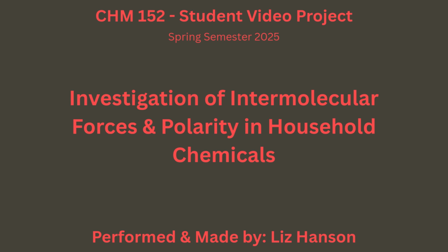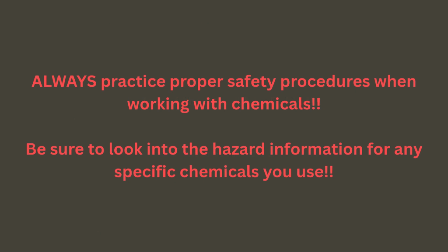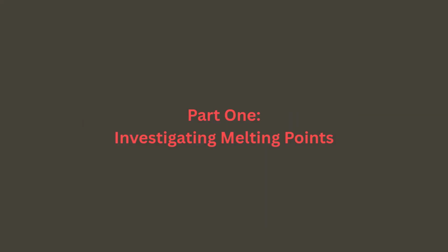In this video, I will cover the investigation of intermolecular forces and polarity in household chemicals. Firstly, we need to make sure we're using proper safety during the experiment. This will include safety goggles and nitrile gloves, and additionally, I will be using a hair tie. It's also important to have another person supervising, so thank you to Peyton for helping with this experiment.